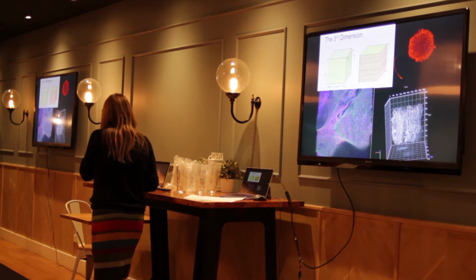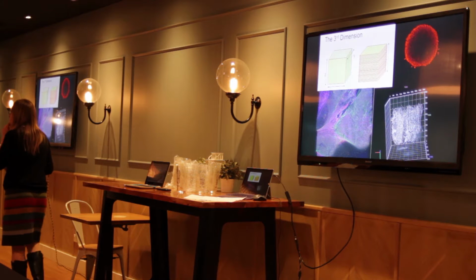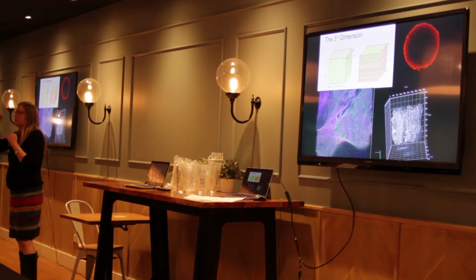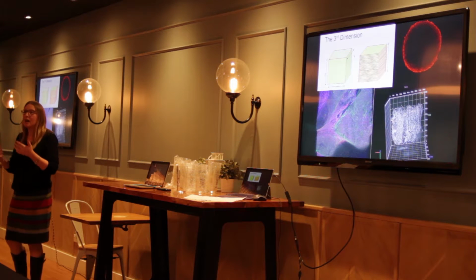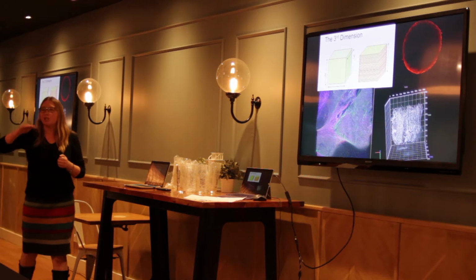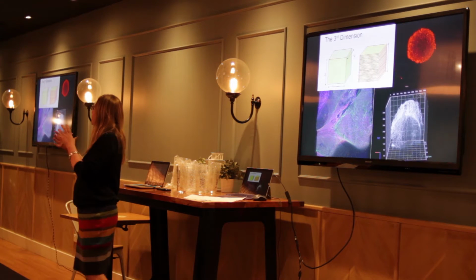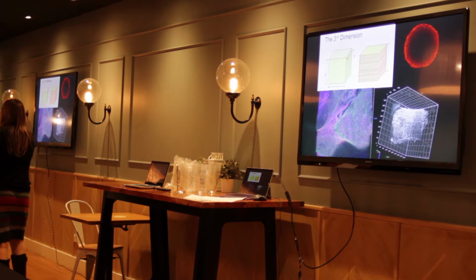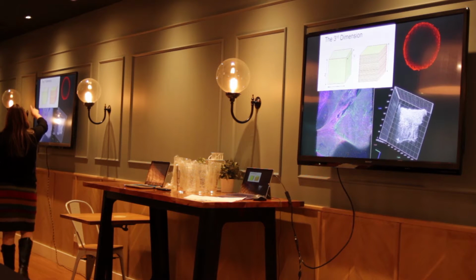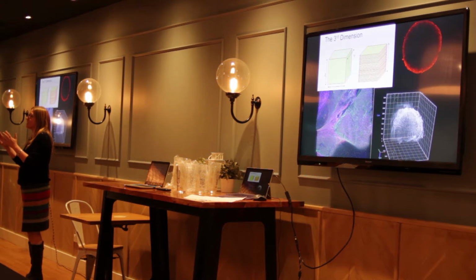Perhaps one of the most important things that most of these microscopes do is that it gives us three-dimensionality. Okay? So what we do is we take those planes and we go through with either the objective or a very fast piezo stage, and we can step through. Image on the top right is a tumour spheroid. We make spheroids with cancer cells, so we mimic a mini tumour. Okay? That's been treated with fluorescence, and you can work out whether your drug's actually making it to the centre of the tumour.